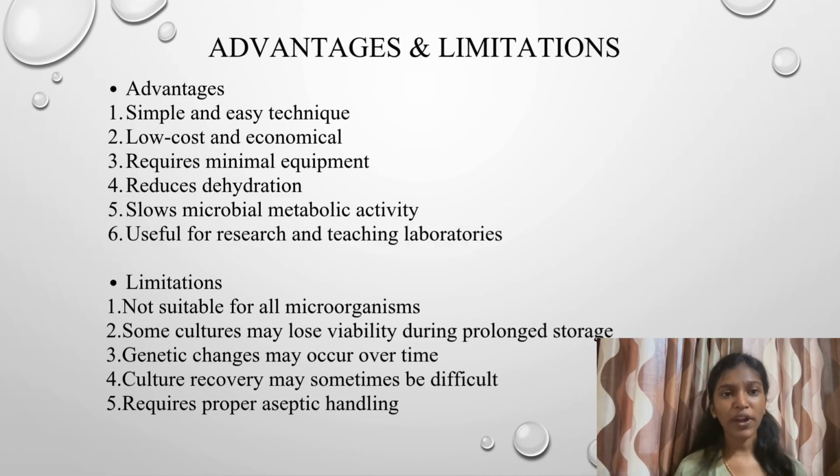The next slide is of advantages and limitations. In this method, there are several advantages. It is a simple, economical process and requires minimal laboratory equipment. This process also helps in reducing dehydration and slows microbial metabolic activity. However, it also has some limitations. It is not suitable for every microorganism. Some cultures may also lose viability during prolonged storage, and genetic changes may occur over time. Proper aseptic handling is also necessary to prevent contamination.